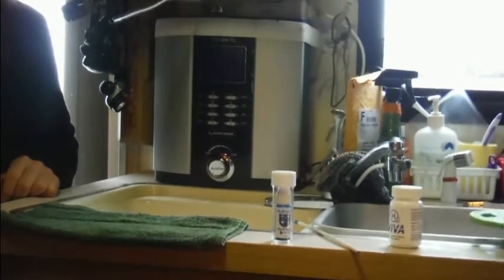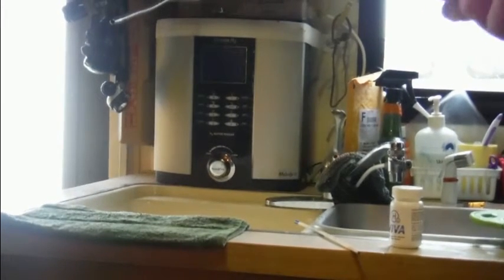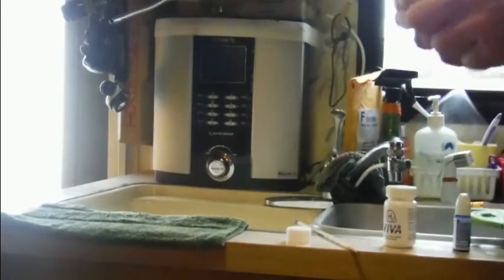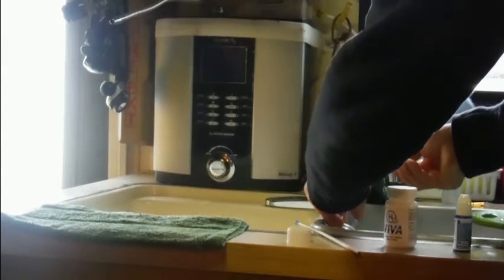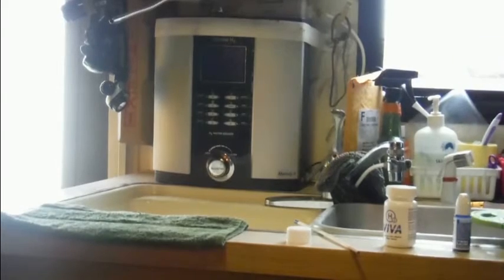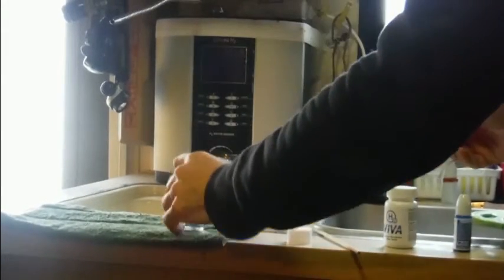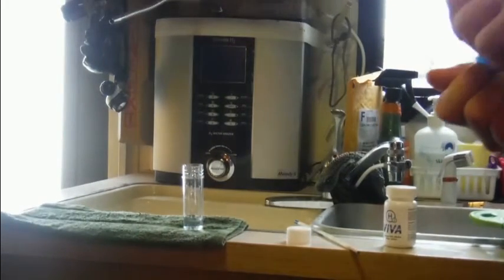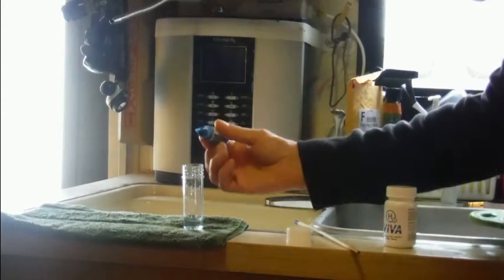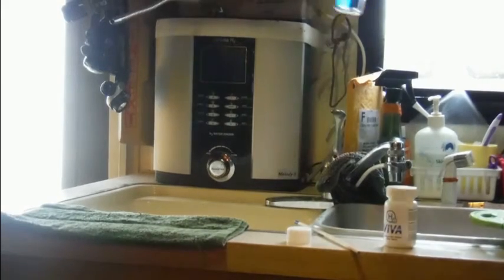Hi everybody, this is Adam Garner. I'm going to be doing some water testing for hydrogen content in drinking water. We're going to use these H2 blue drops, which test the concentration of hydrogen in drinking water by turning the water blue when there isn't any hydrogen — so it's an inverse relationship. I'm going to start with some tap water, which I'm sure doesn't have any hydrogen in it. I'll put one drop in and you can observe that the water turned blue immediately.